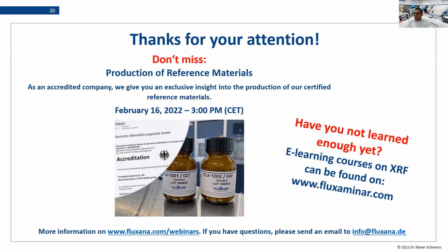For cements, standardless methods versus calibrated methods, how much difference do we get? Well, this depends on how good the standardless method was created. I would say in an ideal case, there is no difference. But of course, in the real world, a calibrated method is always better because it's more standard matched and it's really fresh standards prepared, and it's probably better. Yeah.